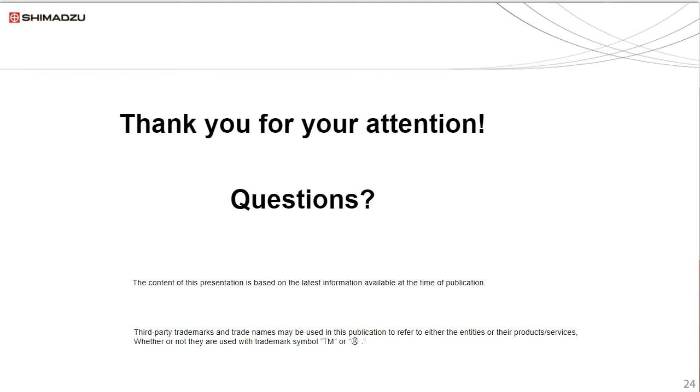Okay, good. So the next question from the customer is, according to your experience, how fast is USP adopting the use of ICP-MS against AA? I think USP is considering ICP-MS to be the gold standard.